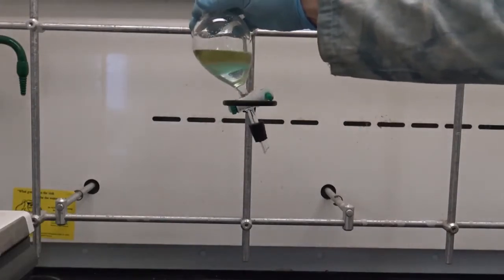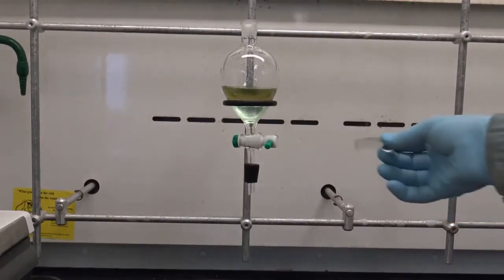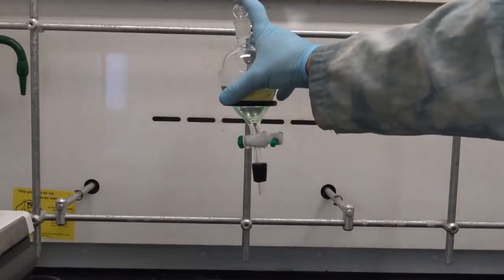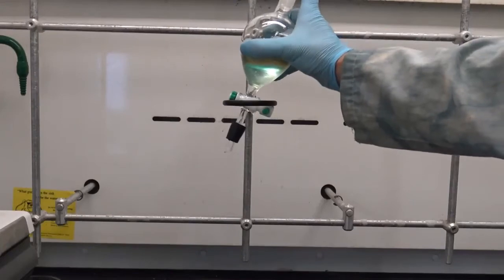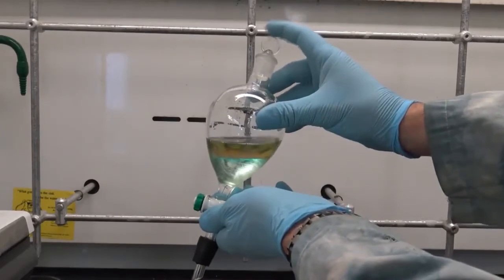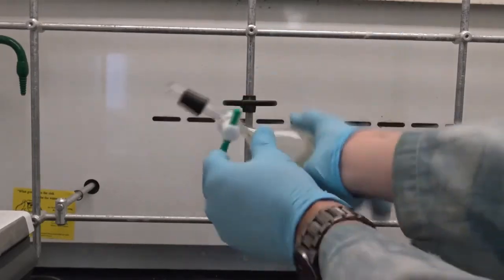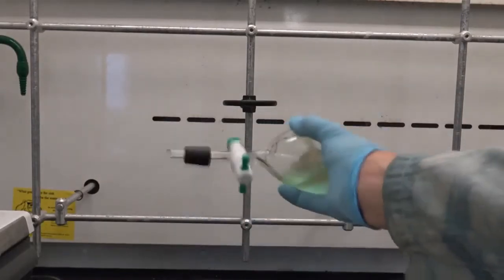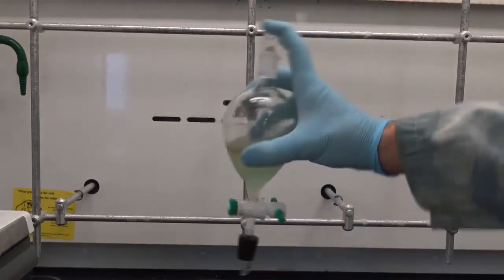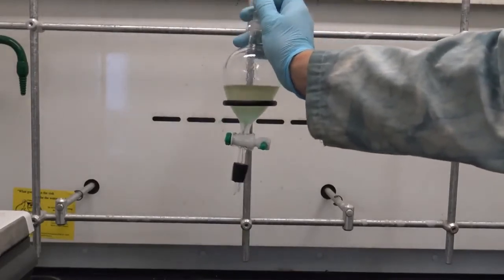Before long, we're going to take a step that ensures that we'll get all of that blue food dye into the water layer. What I'm going to do is take my ground glass stopper and secure the top of my separatory funnel so nothing can come out the top. The reason I'm going to do this is that I have to agitate my mixture. By holding the top closed and inverting the funnel, I cause many small inclusions of one solvent to form inside of the other. This speeds the process known as partitioning, in which each compound dissolved in my original butanol solution gets a choice. Does it want to be in the water? Does it want to be in the butanol?